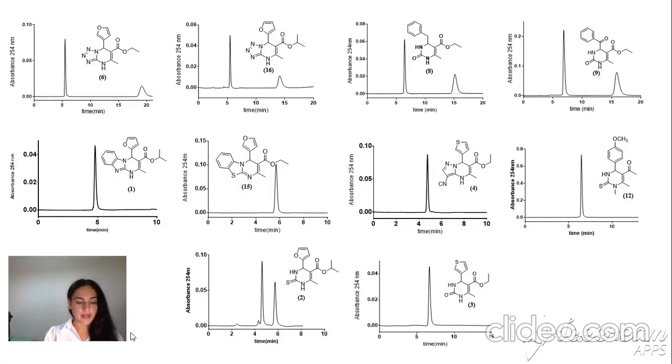These molecules, despite the dihydropyrimidine portion in common, don't represent close congeners, so it's not easy to hypothesize on the structure and enantioselectivity relationship. Observing compounds 1 and 15, it's immediate to think of the involvement of steric effects, but alone they are not sufficient to explain the enantiomer resolution, as we can see for compounds 4 and 12. Most likely, polar interactions also play an important role. We are also investigating compounds 3 and 4 because at the moment we cannot explain their behavior.